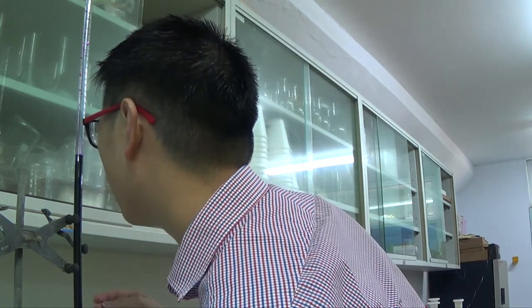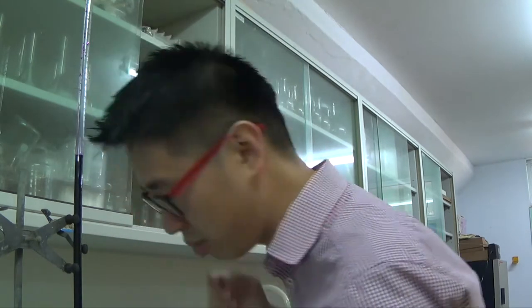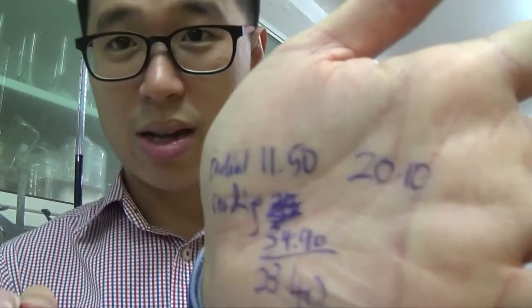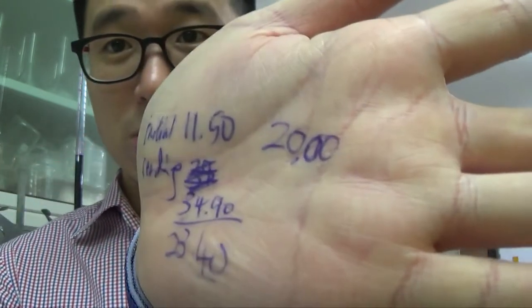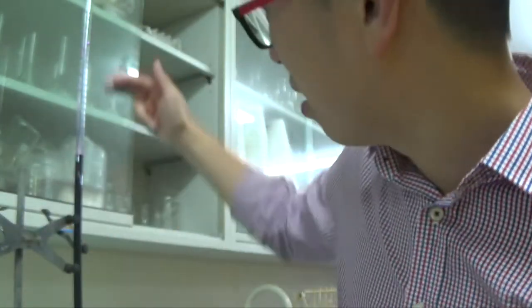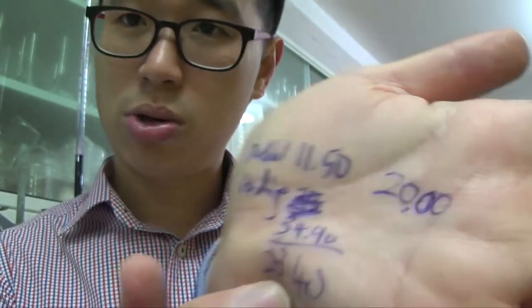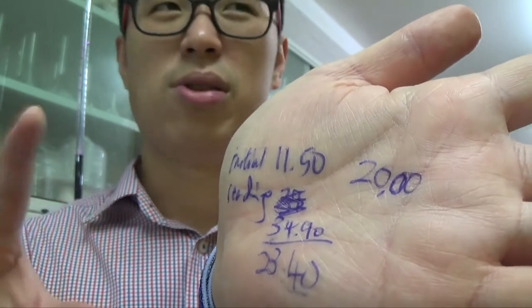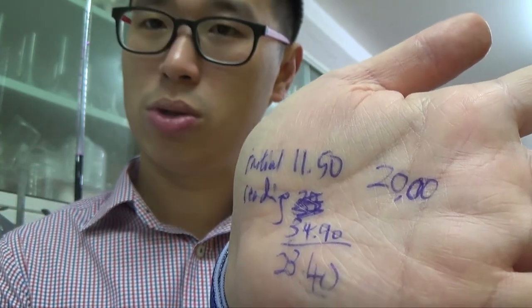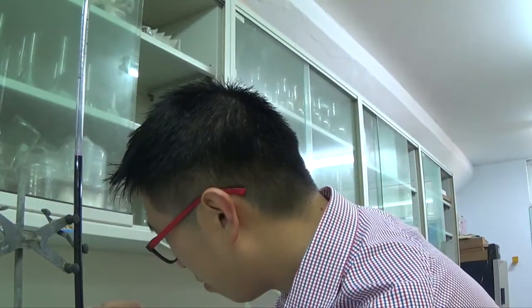See, when you leave it for some time, it actually goes up again, because there was some that actually flows down, right? So now it reads 20.00. So just now I wrote down 20.1. But now you should always read before you start: 20.00, because you get some of the things that actually drips down, right? So that could affect the result to some extent. 20.00 plus 23.40 is 43.40. So 43.40, if you take away 1 cm cube, is around 42.40. So I'll stop around 42.40.